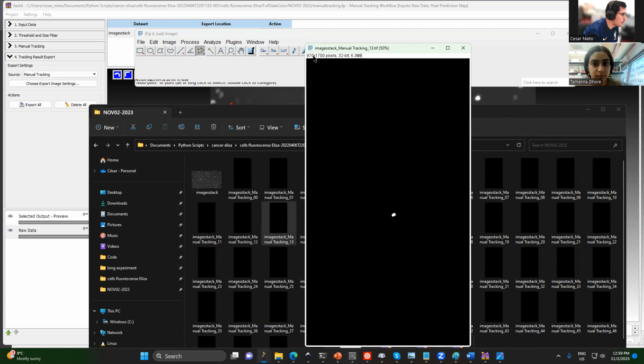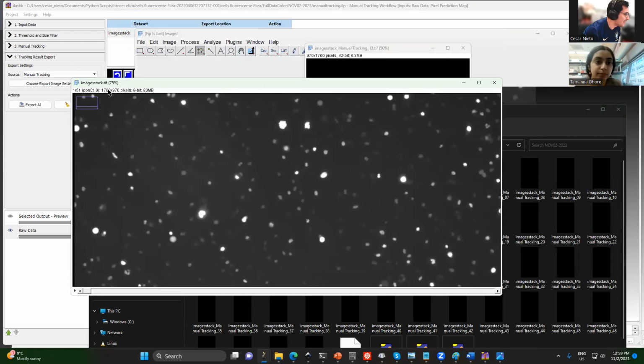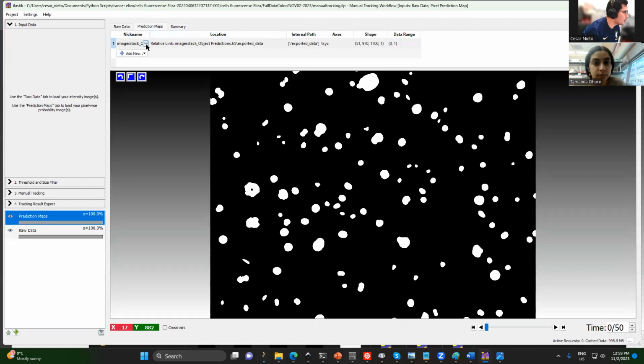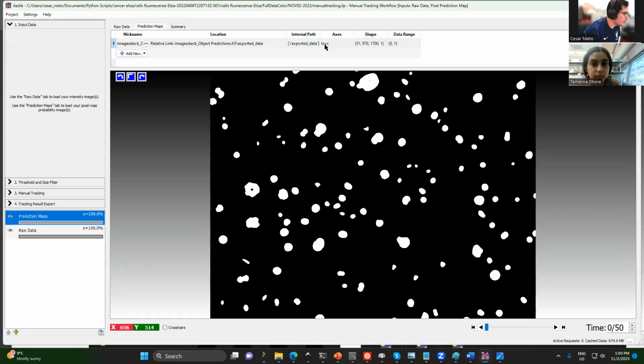So it seems that this file is flipped, because the original image was the opposite. 1700 in X, so it seems that I did this wrong.